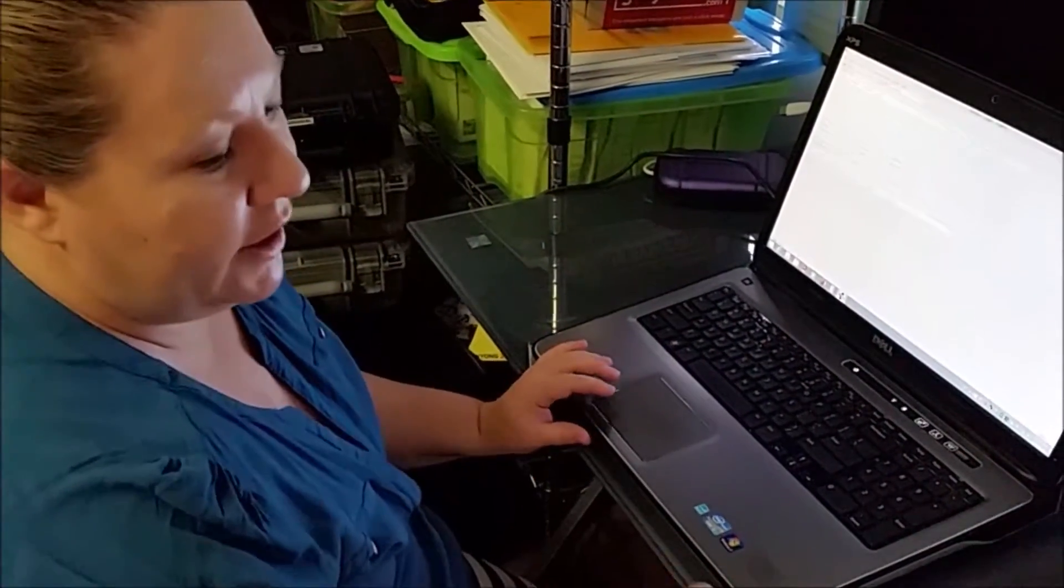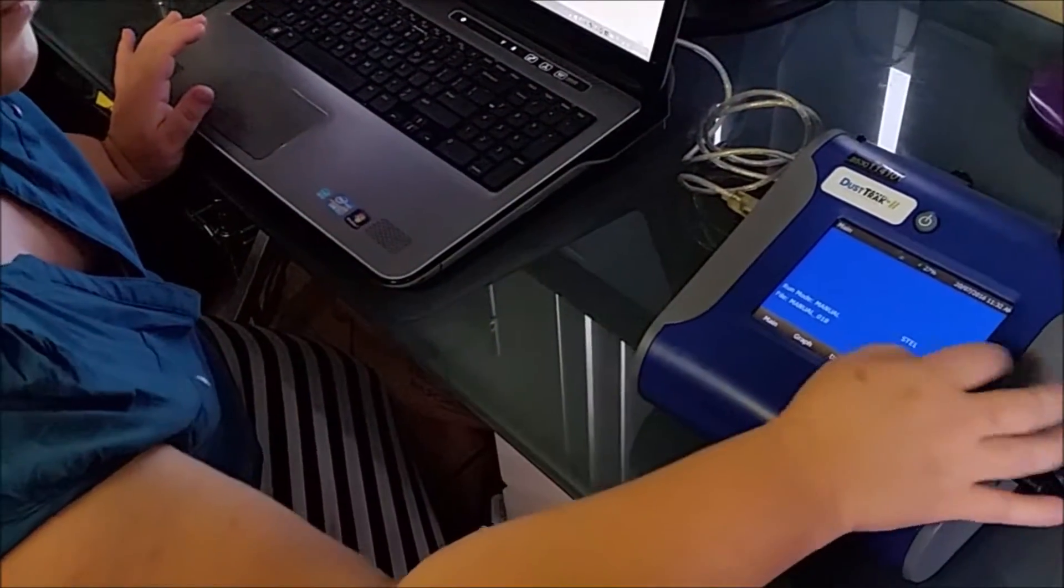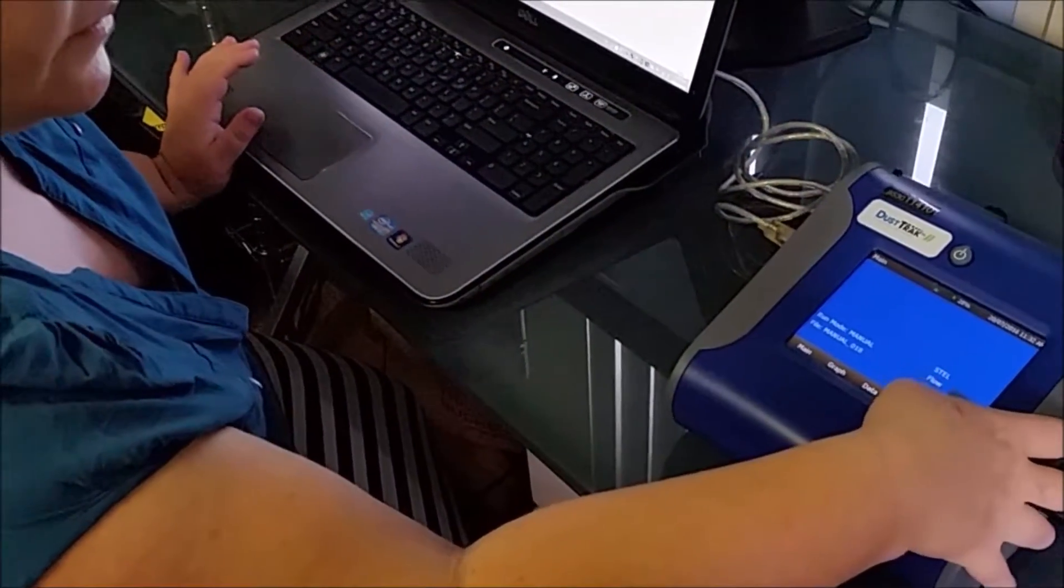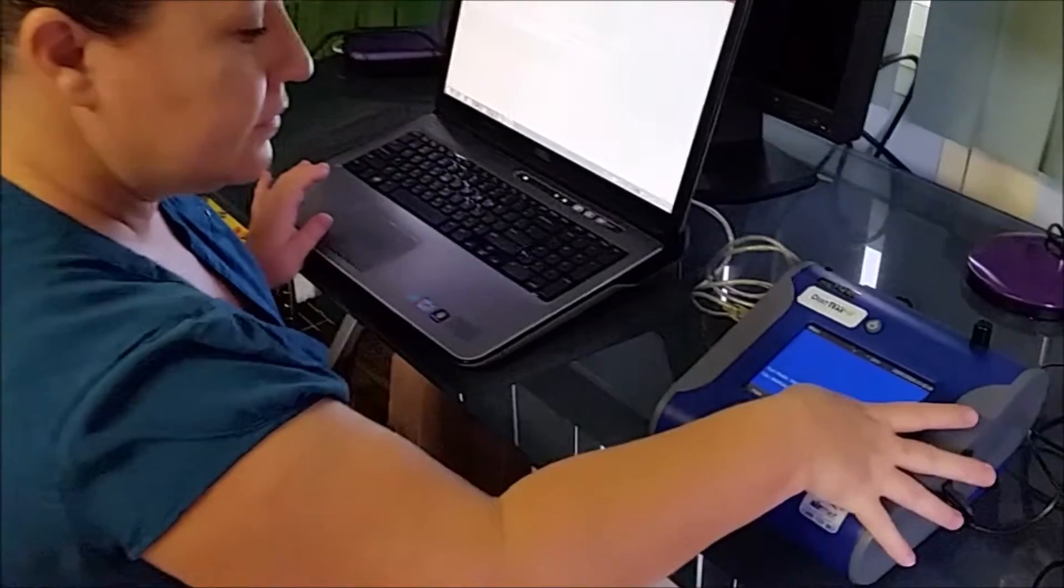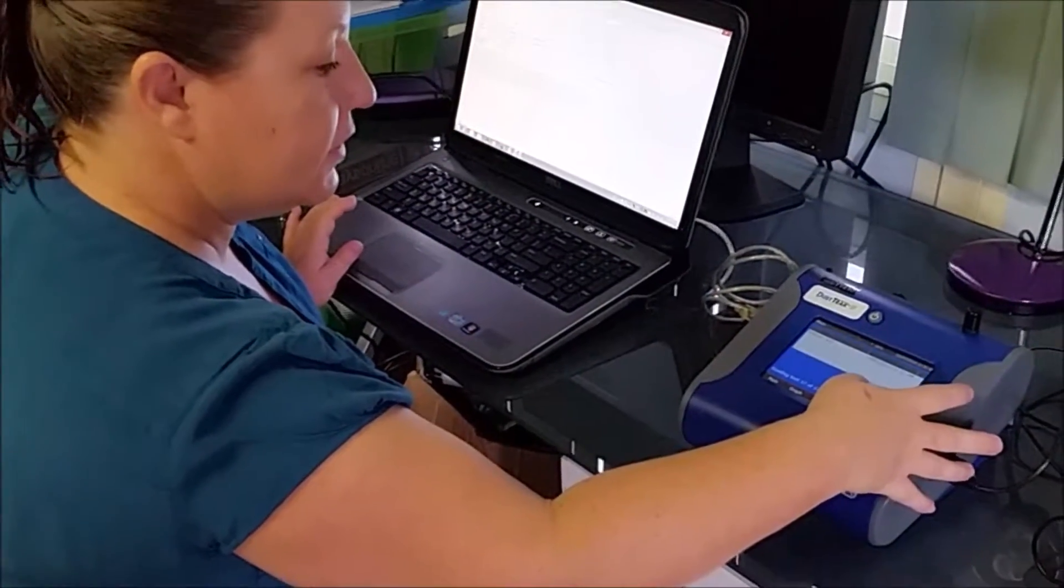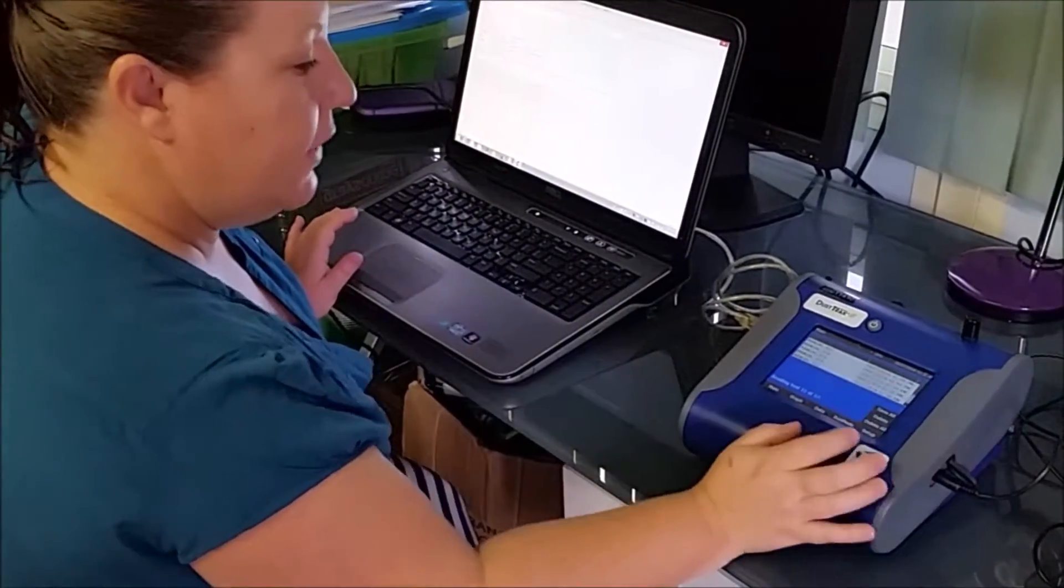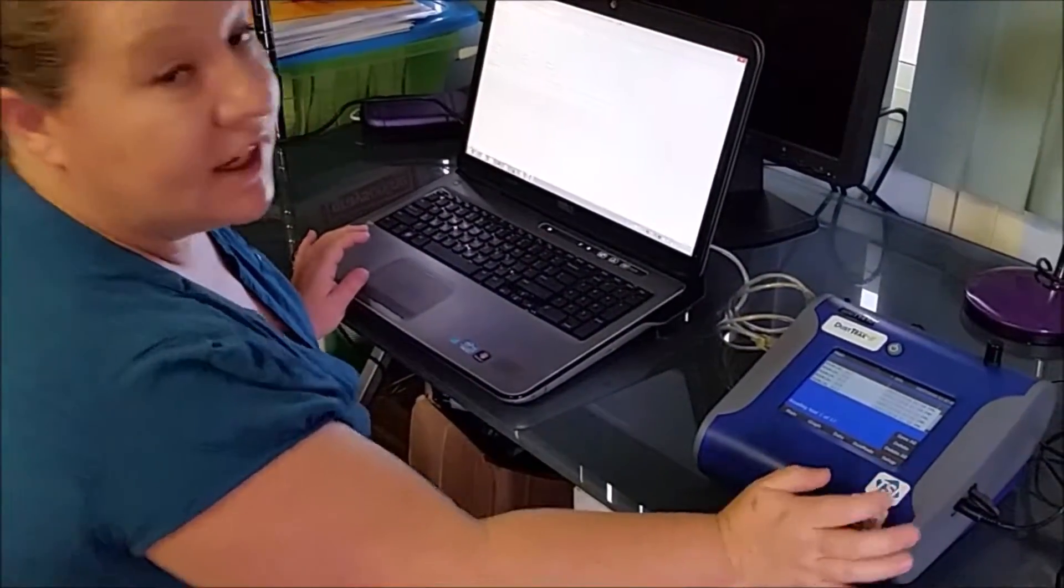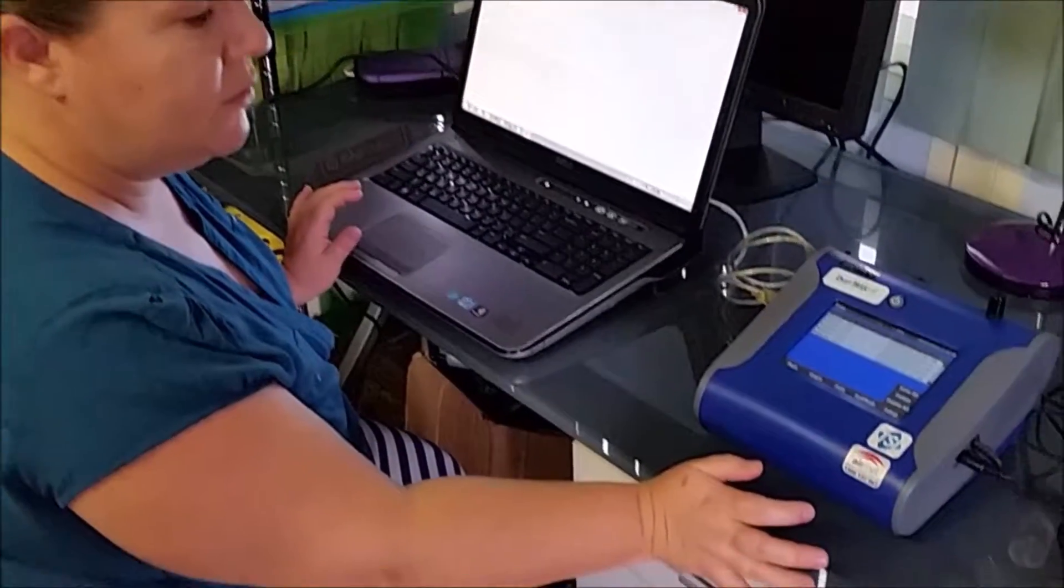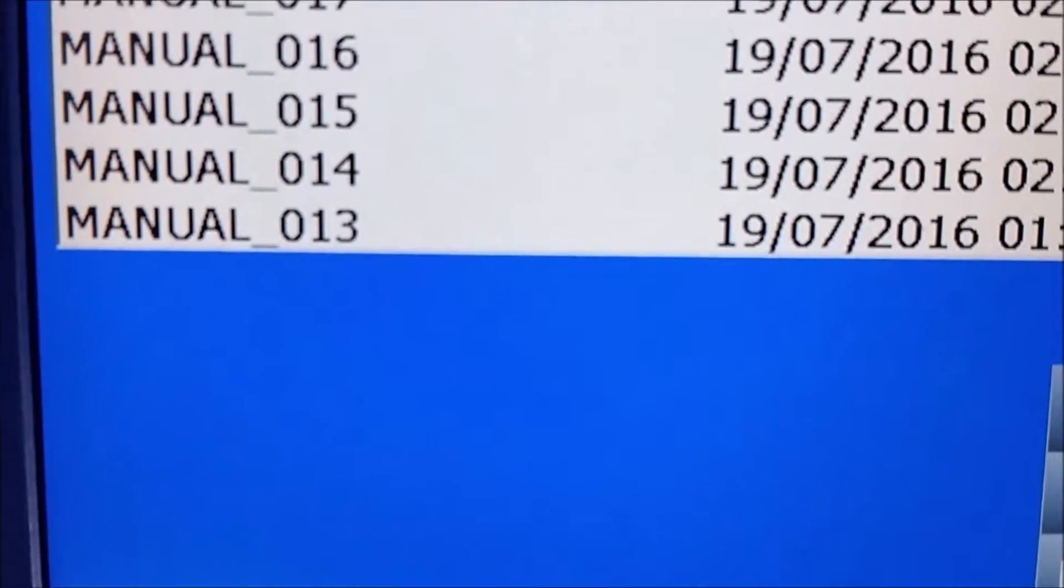At the moment, we have 17 samples that are already in the Dust Track and we want to download these into the TrackPro.